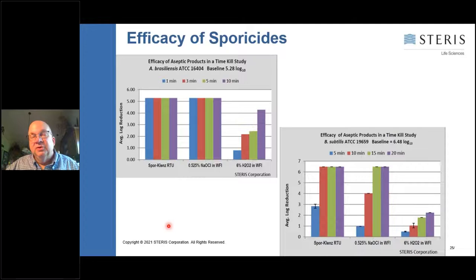It's very critical and important in the industry to actually do some testing with the products you're using, because as you can see here, we did some testing with different biocides at a pharma company. And what we find is the hydrogen peroxide peracetic acid chemistry performs pretty much the best in all these circumstances against molds, such as the very hard to kill Aspergillus brasiliensis spores. And down here, if you look at it against Bacillus subtilis bacterial spores, it does really well. Bleach, so 5,250 ppm of available chlorine in bleach, does very well as well against fungal and bacterial spores.